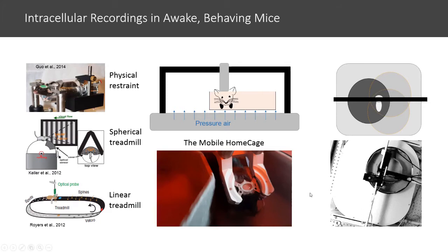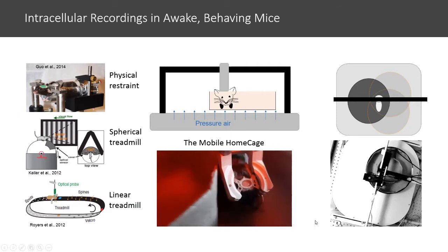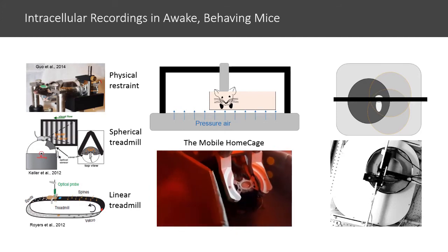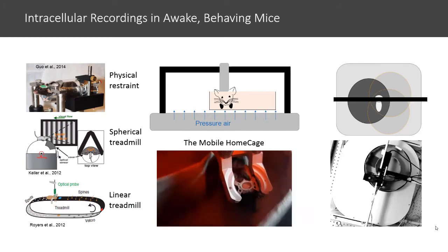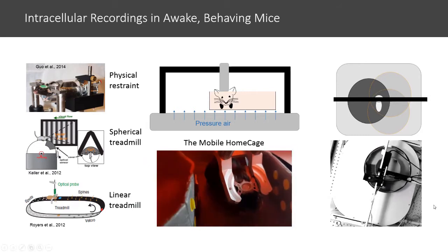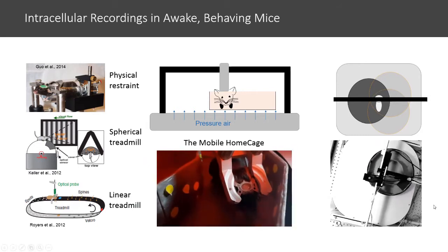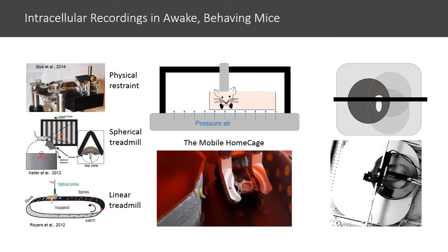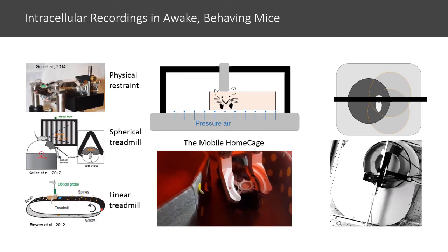So we're very interested in using this mobile HomeCage setup provided by Neurotar because it allows you to head fix a mouse over a floating flat-floored arena which can be voluntarily moved by the animal, allowing them to freely explore the environment like this. The mouse is fixed in the same location relative to an external observer, whilst maintaining the perception of moving around a maze. So here you can see how this looks from above. The mouse is fixed in this position here, and the whole environment moves around them. So this system allows you to track the animal's behaviour in 2 dimensions, whilst providing them with more naturalistic sensory stimuli that you wouldn't get in a virtual reality system.